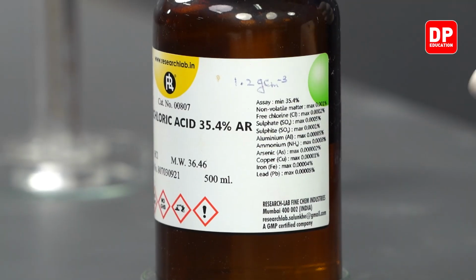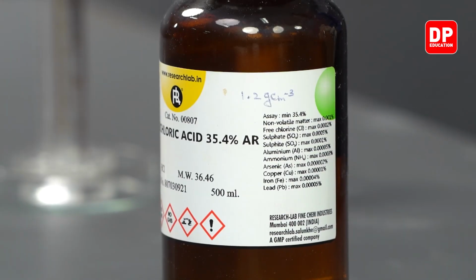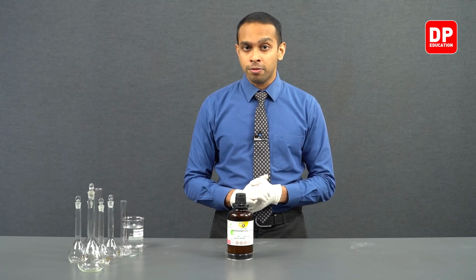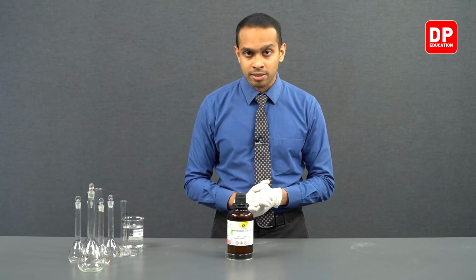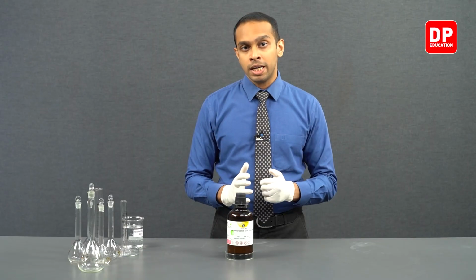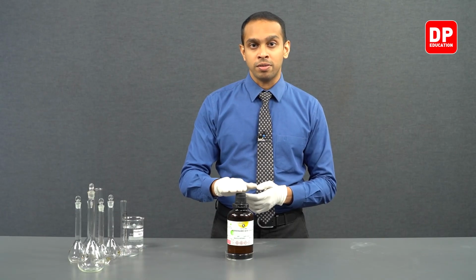After going through the information found on the reagent bottle that we have here, we have calculated to make 250 cubic centimeters of 1 mole per decimeter cube concentrated hydrochloric acid solution. We need to measure exactly 21.5 cubic centimeters of this hydrochloric acid that we have in front of us.